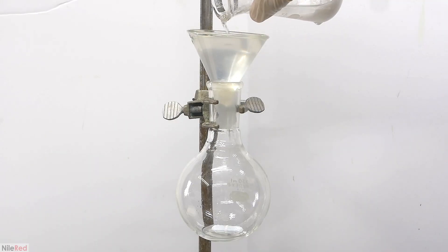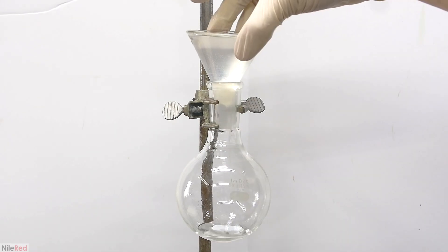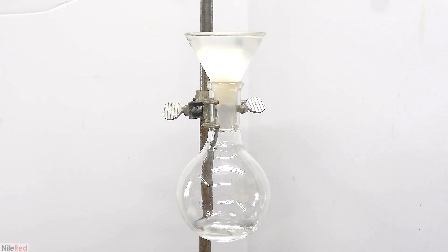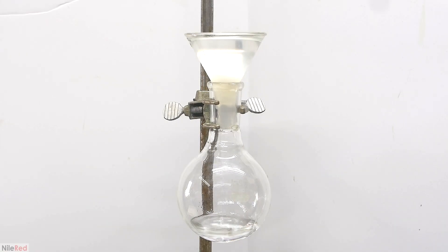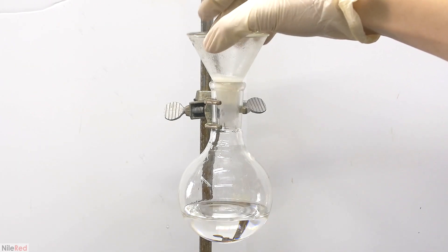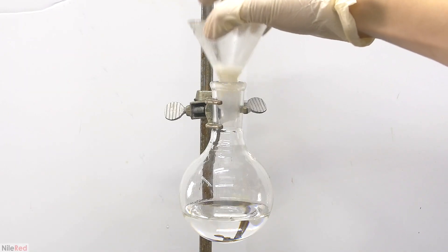The magnesium sulfate is then separated from the benzaldehyde by filtering it through a little bit of cotton. What filters through is some nice crystal clear benzaldehyde, which indicates that pretty much all of the water has been removed. After everything is filtered through, the funnel is removed, and I seal the flask using a stopper.